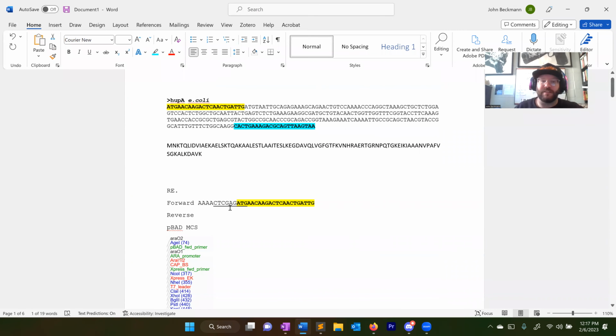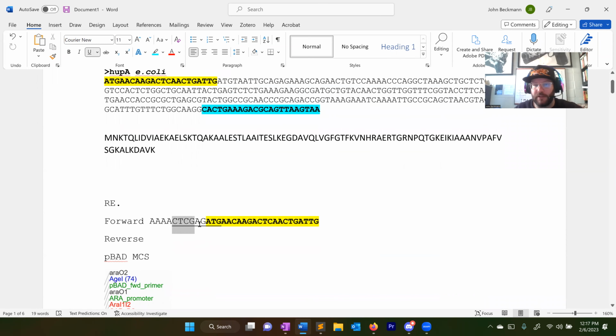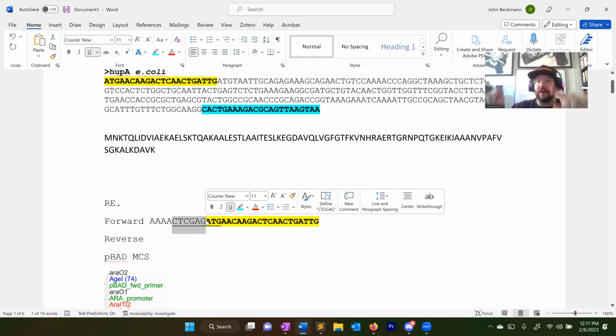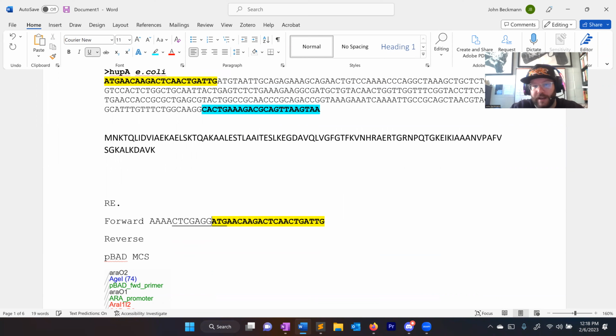Now, this is a very specific example, with this one protein that we're cloning into this one vector. If you want to generalize this concept, the simple idea is that when you add these restriction enzyme sites, if you're cloning things upstream of that vector start codon, you have to make sure that whatever your restriction sites are adding in, or whatever tags you're adding in, say you added some extra bases here, you might add some number of base pairs that's not divisible by 3. And if you do that, you're shifting the frame. And so you need to shift the vector that you're cloning into accordingly.